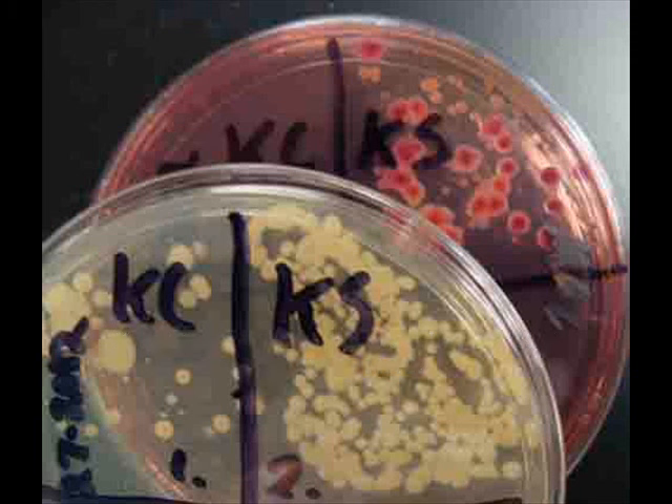Here's the result of an interesting experiment that we do in the laboratory section of the applied microbiology course I teach. Students bring home sterile plates of TSY — tryptic soy agar — a general all-purpose medium, and a sterile plate of MacConkey's. At home, they obtain bacterial samples from different areas of their home. Pictured here are samples from the kitchen sink. The sample placed on TSY is growing a wide variety of microbes since that medium is not selective.